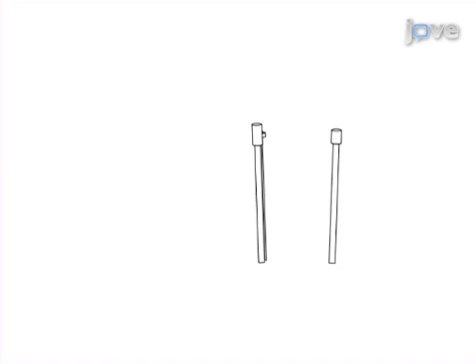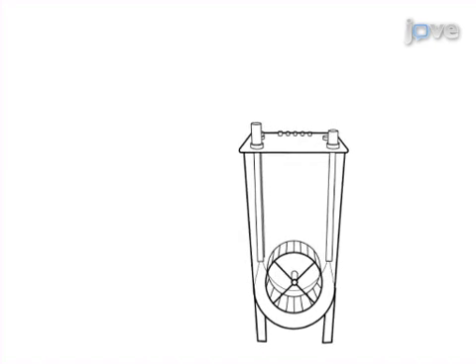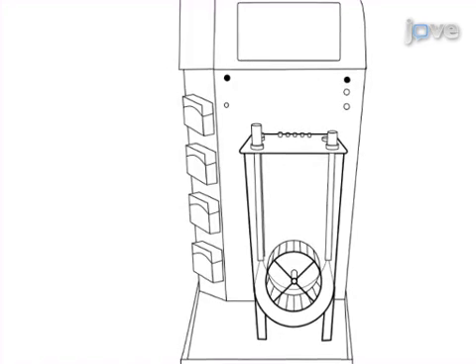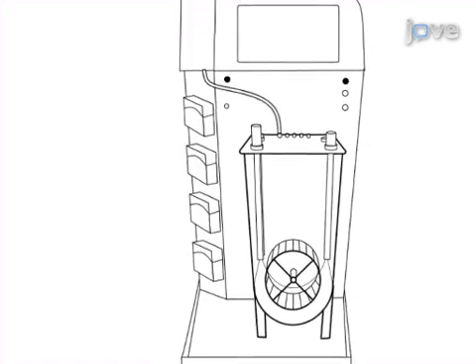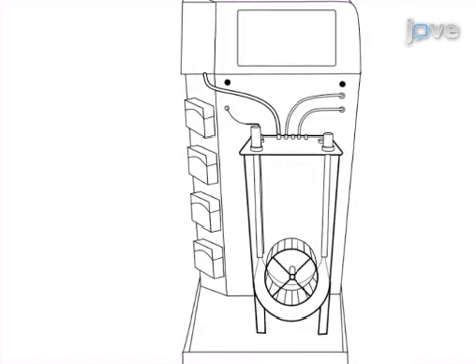The second step is to insert the probes and the sleeve into the vessel and to position the vessel on the bioreactor and to connect the exhaust filter, the gas lines, and the temperature probe.